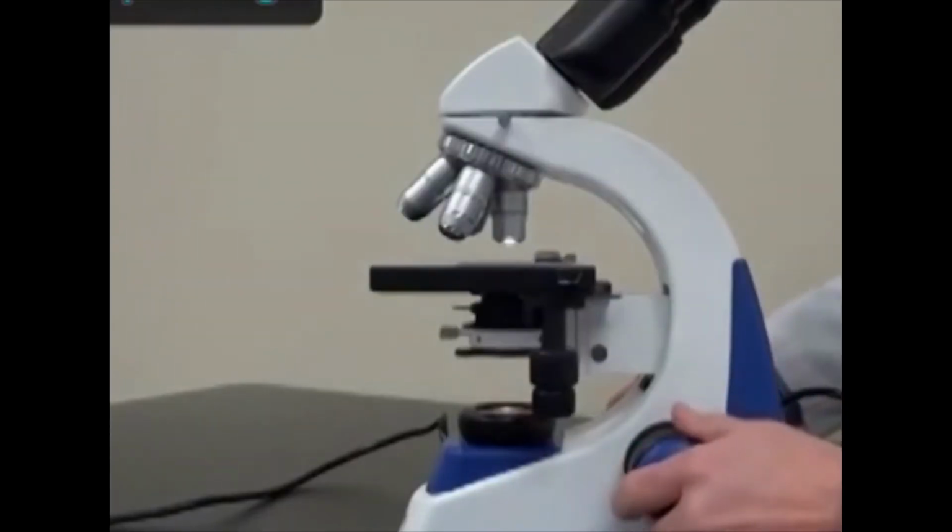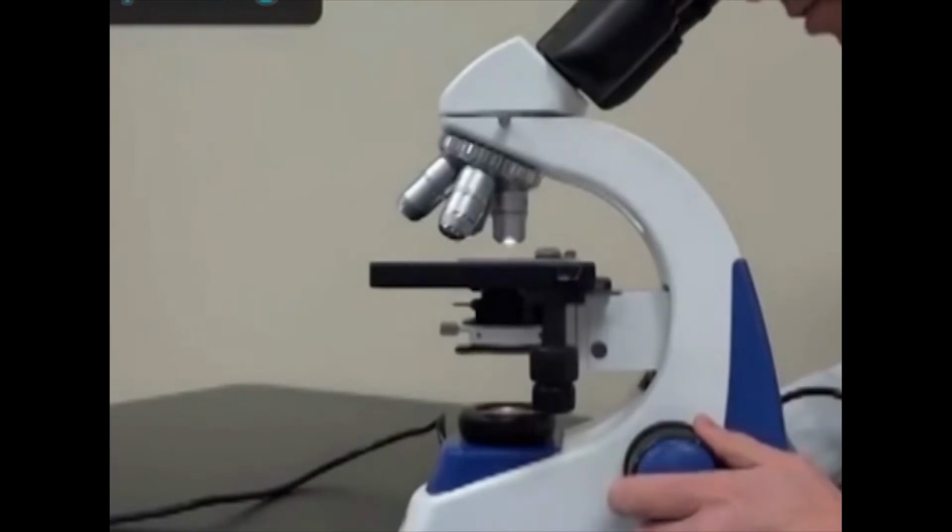Generally, focusing is done by raising or lowering the microscope tube with its optical parts attached. Coarse adjustment is effected by a rack and pinion by operating the large knob, while the fine adjustment is effected by operating the smaller knob.